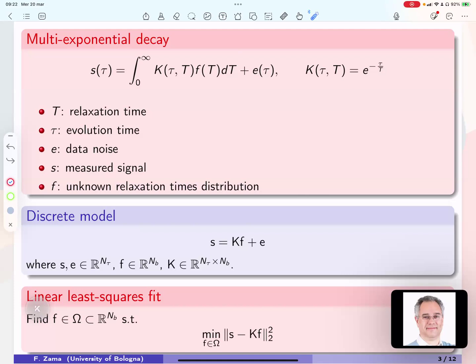In this case, we see this decaying exponential function, and in general, in other types of NMR relaxation problems, we might have a different type of kernel, but the fact that we have anyway sufficiently regular functions to define this integral equation gives us the ill-posed nature of these problems, in the sense that when we want to discretize this problem and we try to solve this problem from a discrete point of view, what we obtain is a matrix that has characteristic ill-conditioned behavior.